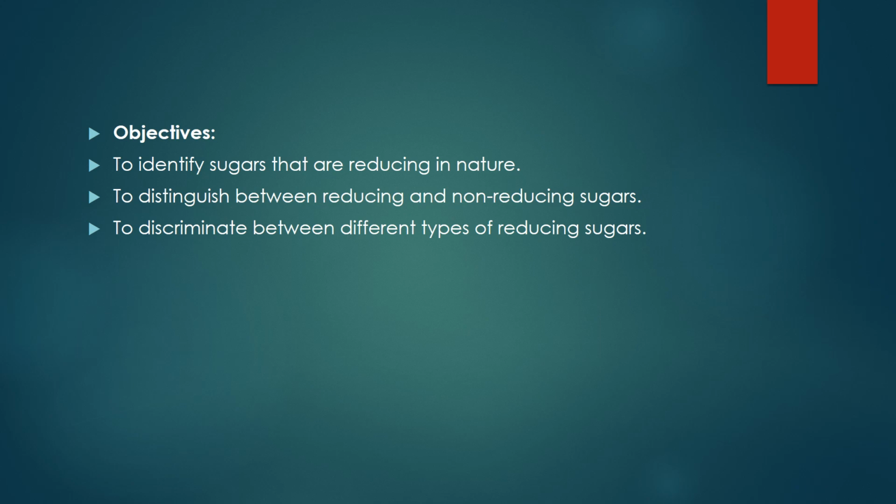To distinguish between different types of reducing sugars, as I said to you, because different reducing sugars have a different time for formation of osazones, and also different shapes and structures for osazone crystals, because the result will be the formation of crystals, not a color.